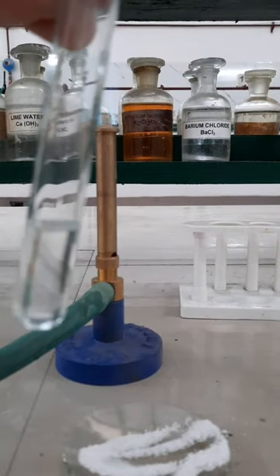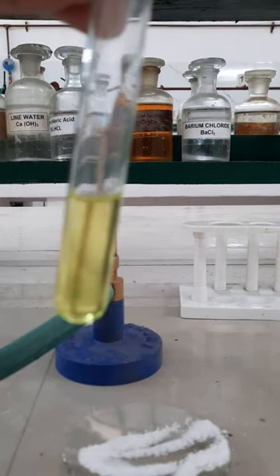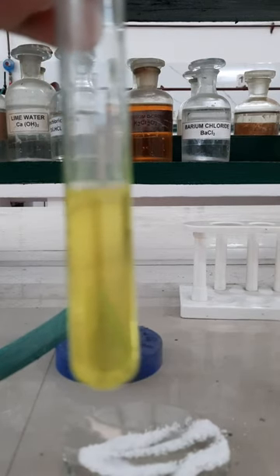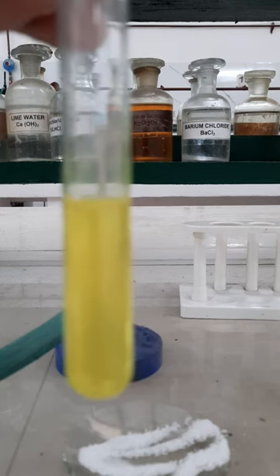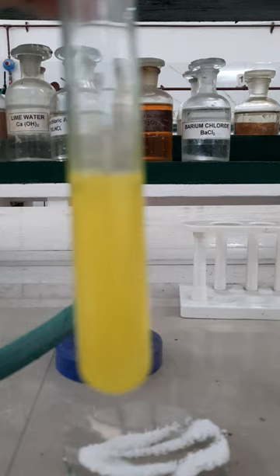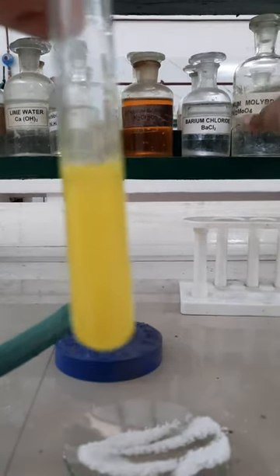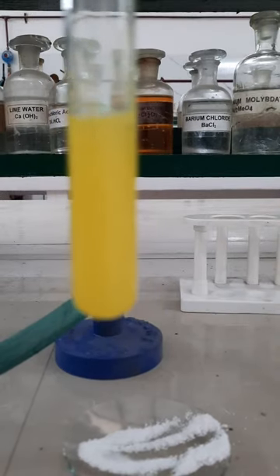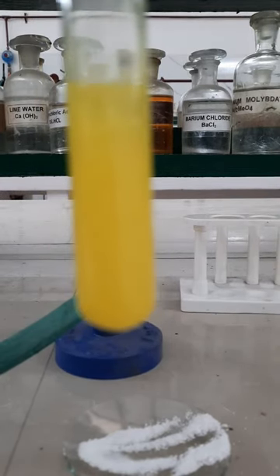Record the observation. A yellow colored precipitate will be obtained. This precipitate is due to the formation of ammonium phosphomolybdate and this will confirm the presence of phosphate in the given salt.